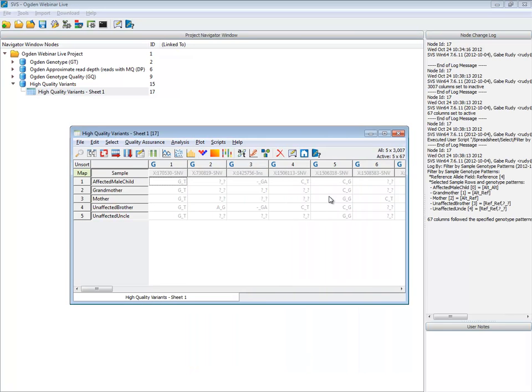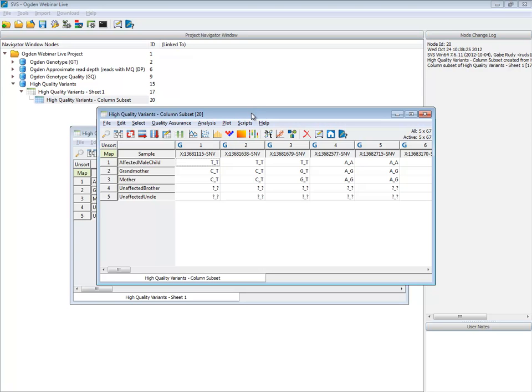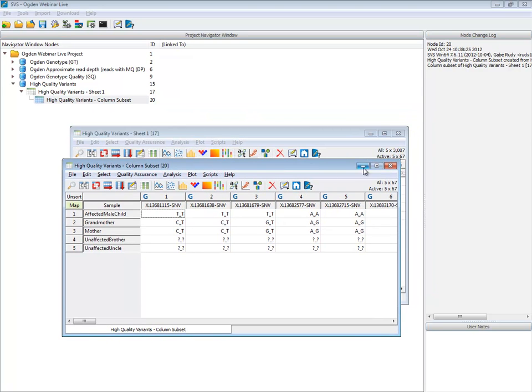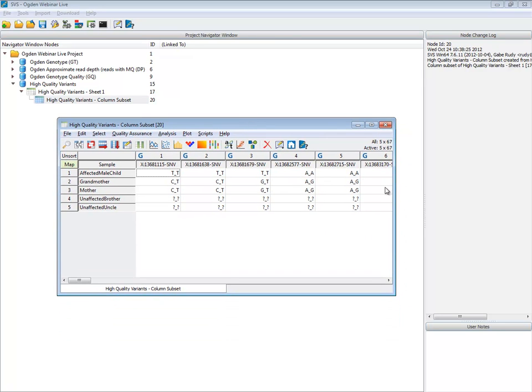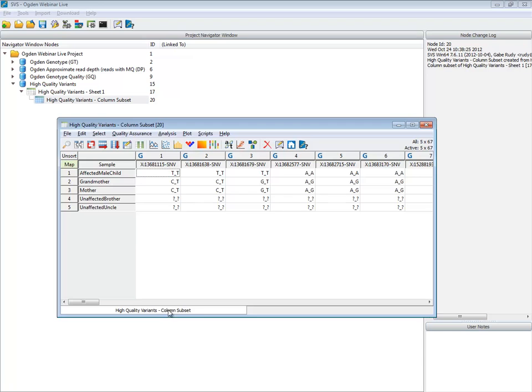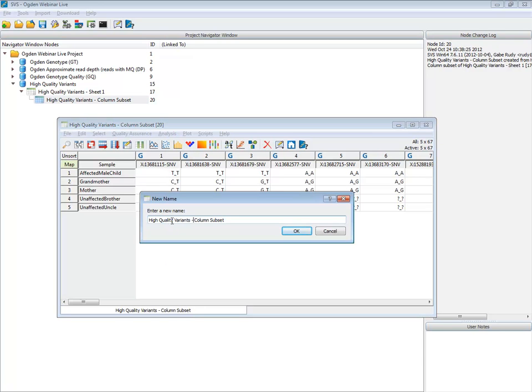As we apply that filter, we take it down from 3,000 variants to a meager 67 that match that inheritance pattern. This is why experiment design can be so effective at getting to a robust conclusion, because even with just that information, we have a very manageable set of variants remaining. So let's rename this as our high quality candidate variants.